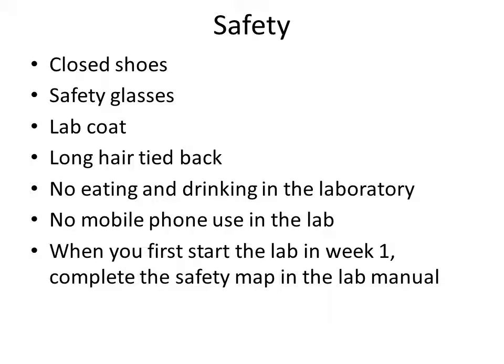The only exception to this rule is that you may use your camera to photograph some results for your report, such as your TLC plates in Experiment 5. There's a safety map in the lab manual which will help you identify all important safety features. You must complete this map and have it signed by a demonstrator when you first come to lab and before starting any experimental work.